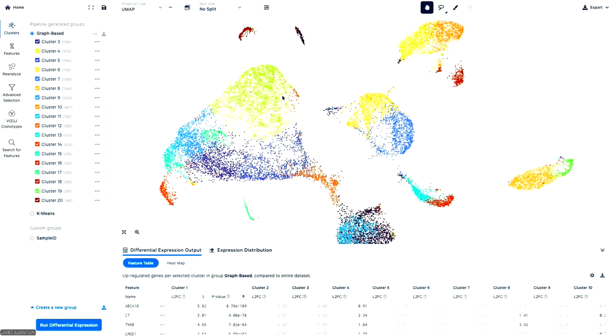It does matter where you are. I don't have an answer why this dot is in here. I didn't really look at that, to be honest. It would require some more in-depth analysis. But there could be situations where a cell is somehow similar to the green dot and it's put in there, but it's not exactly belonging to the green dot. And the pipeline thinks that this is actually here instead of being at the edge. But how that is determined is really beyond what I know.